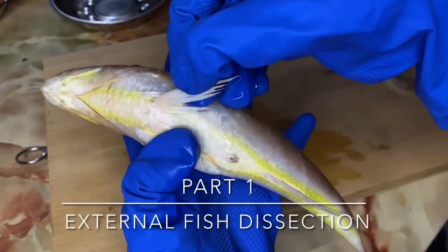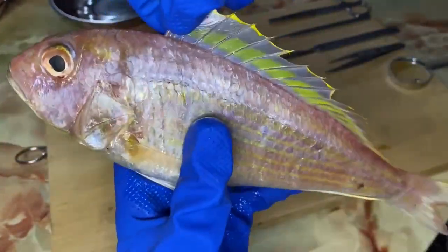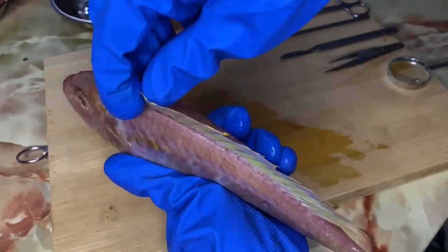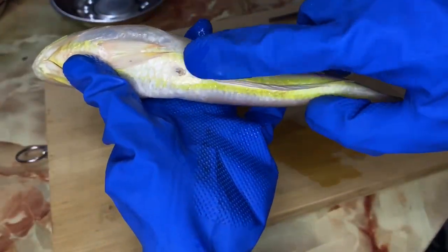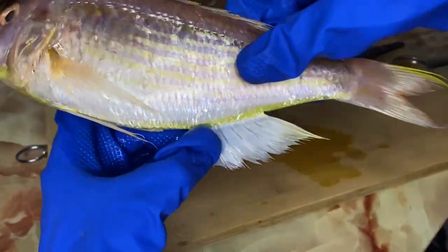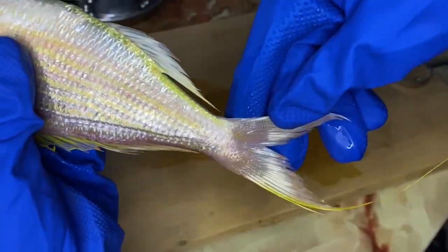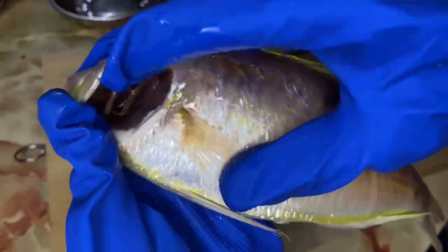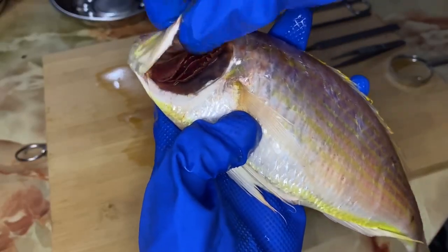Part 1: External fish dissection. Firstly, I check the pectoral fin if there are any parasites present, then the dorsal fin. As we can see, here is the anus and here is the anal fin, and the caudal fin. I also lifted the upper operculum and checked the color of the gills. The color of the gills is bright red.